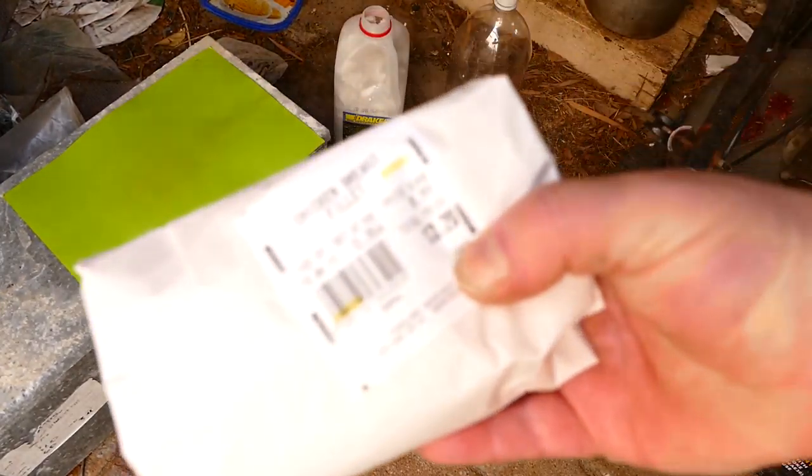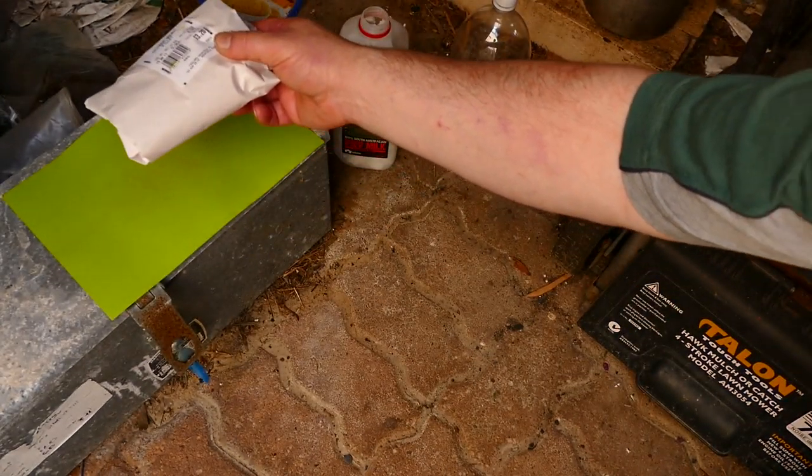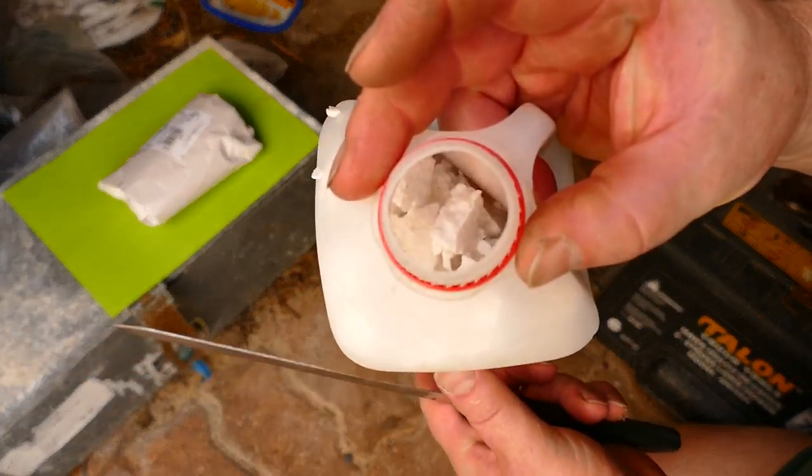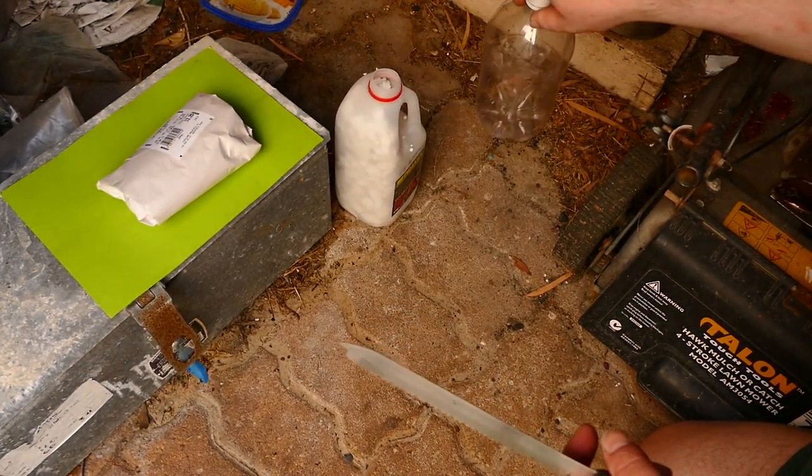We've got a chicken breast. Let's put it down. Get a trusty knife — the idea here is I'm going to make two setups. I've got one here and I'm going to put the chunk on top so it sits on the most aerobic part of it.